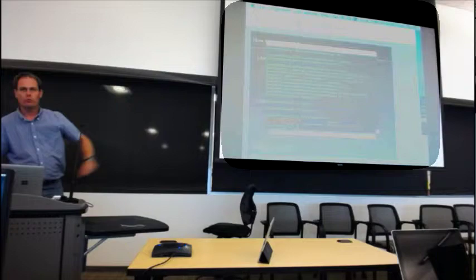Now, every time you select a new experiment, it actually goes into a little dot file. So there's the list of all the experiments that I've got saved by default, and I can just click into that list. If you're doing this for the first time, of course, you won't have that list, so you'll have to go find a different experiment.